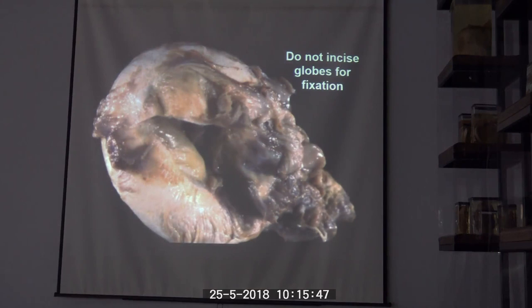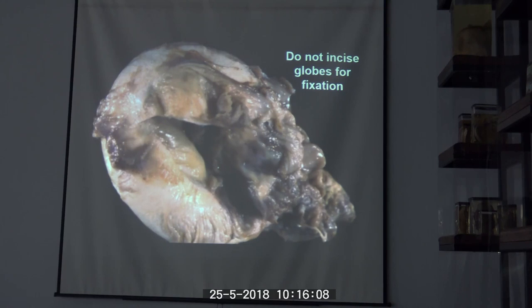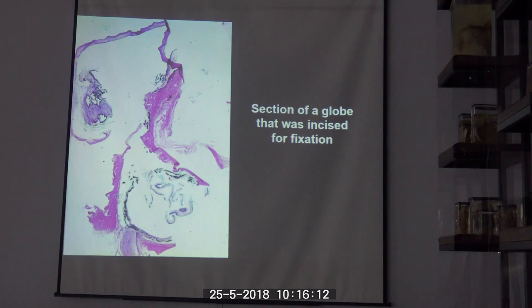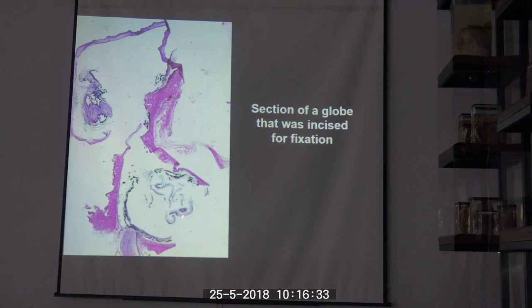Something that sometimes happens by accident — mostly when students collect globes from the necropsy floor, but also when people do it on purpose thinking they are helping — is incising the globe to facilitate formalin penetration. The problem is that you may end up with a specimen where everything starts falling apart, especially if the tissue is not well preserved. This makes it very tough to interpret changes, including whether retinal detachment is real or artifactual.